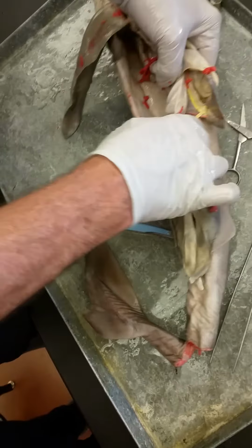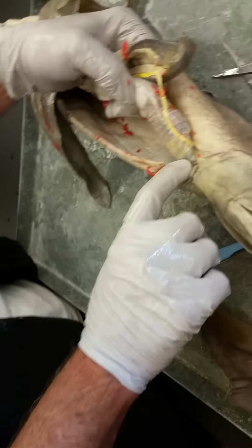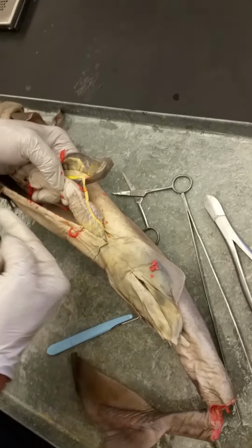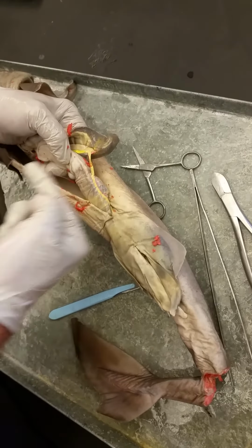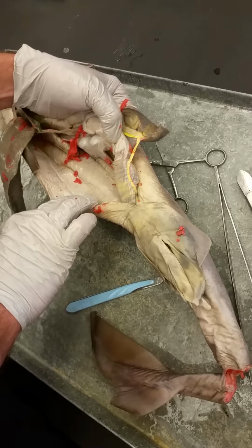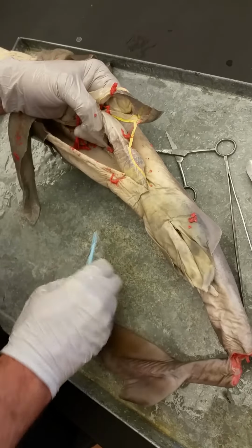And that is this structure here called the spiral valve. The spiral valve is their intestine. But instead of just being a straight tube, the inside of it has ridges that make a spiral staircase pattern. So by the time the food travels from here to here, it is going around and around and around. It gives a long residence time without filling up their body with a whole lot of intestine. So let's see if we can open this up and see that structure.